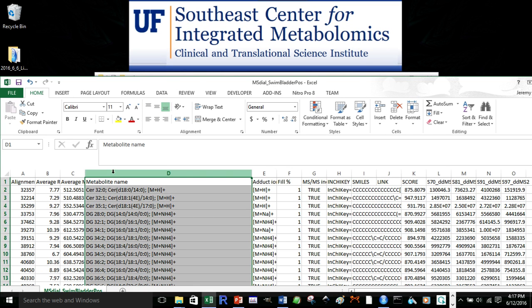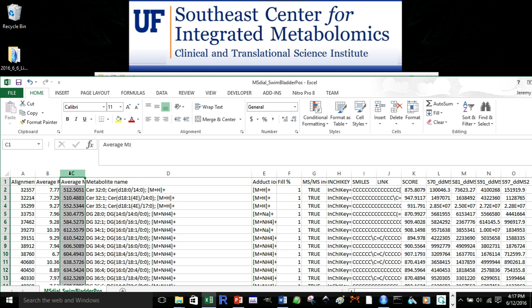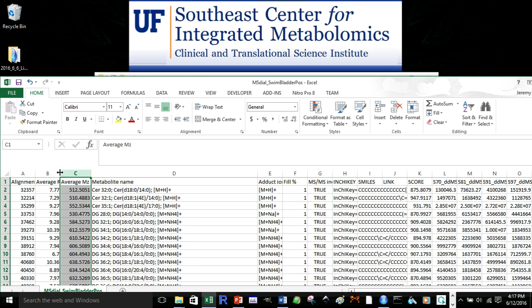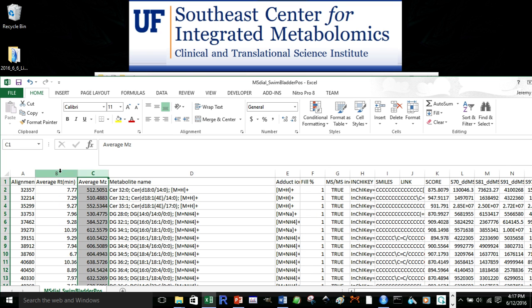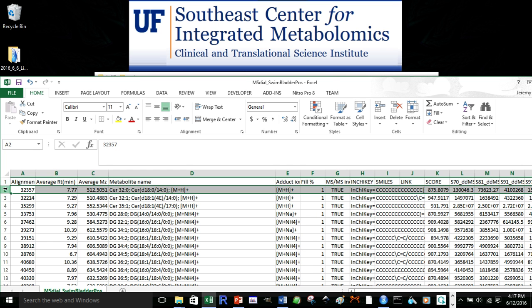So, that would be column 4, the mass of charge would be column 3, and the retention time would be column 2. And we'd also want to write down the row the data starts in, which is in this case, row 2.